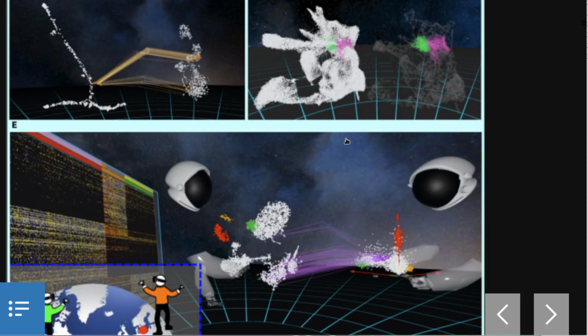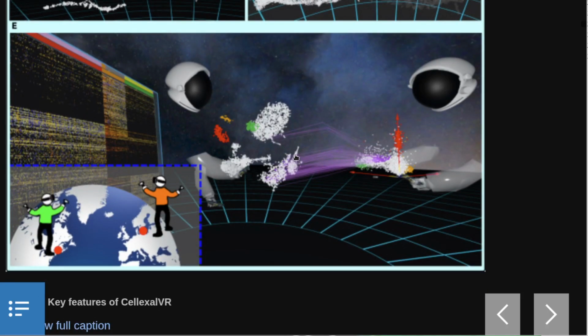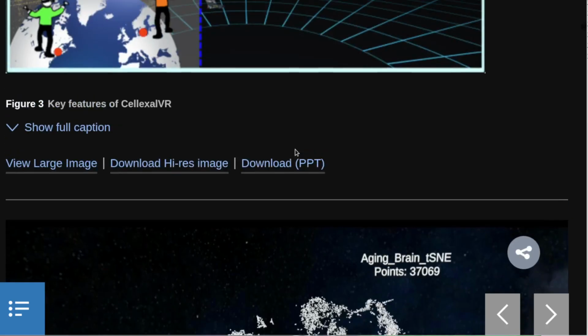Cells can also be colored by user-provided attributes, and for dense maps they can be rendered in a separate plot embedded within a translucent skeleton of the data to orientate their position within the total graph, Figure 3D, Video S3. Here, the two classes of mesoderm from 116K cells assayed during mouse gastrulation shown in Figure 2 are shown, where the interface between these two cell types is much clearer to see when spawned separately. Figure 3: Key features of CellexalVR.